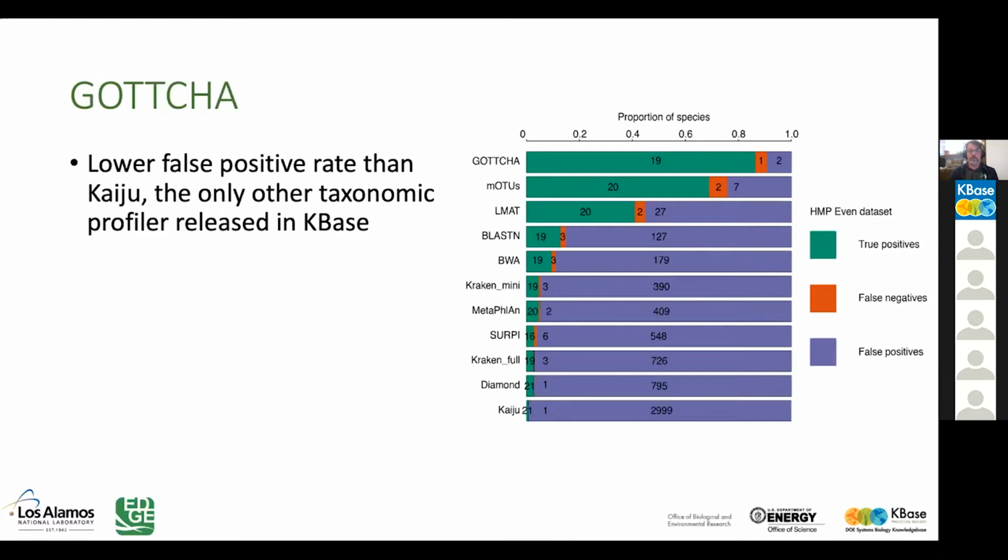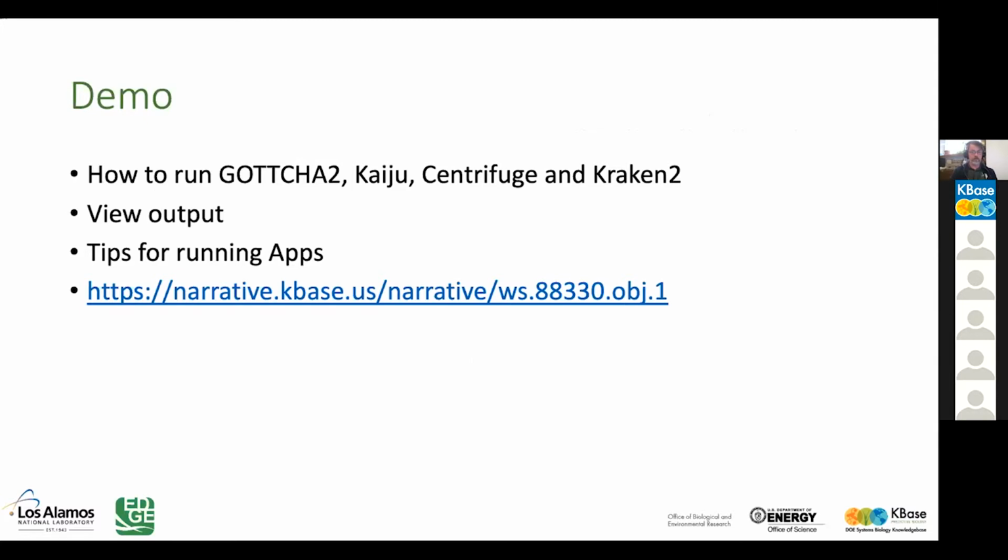I should say these were tested on a synthetic data set, so we knew exactly what species were in that sample, so that you can give a true profile of how well they perform. So now I will give you a brief demo, show you about the output, and then I'll talk about the tips for running the KBase apps.